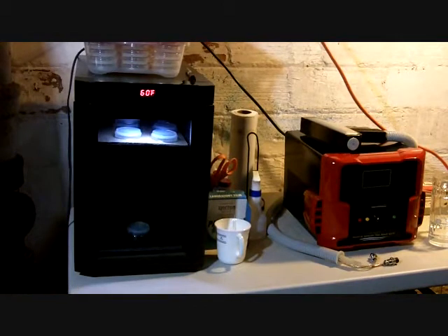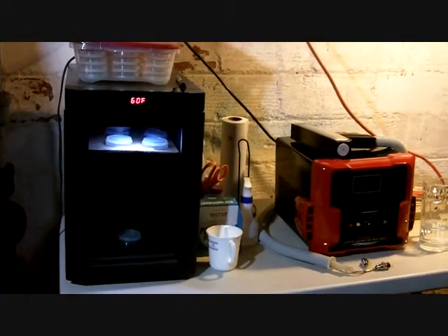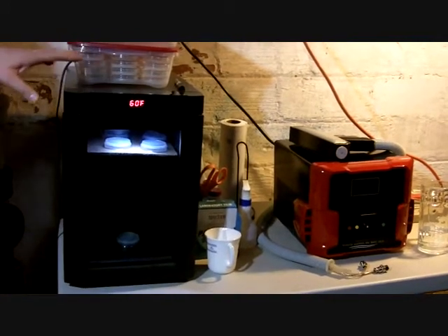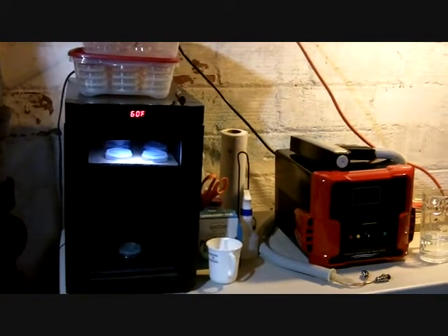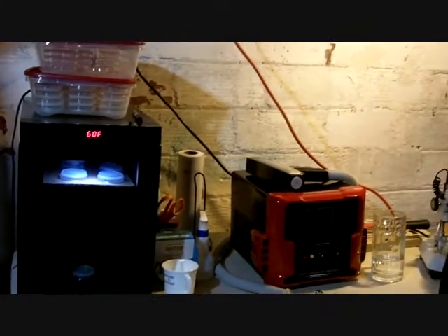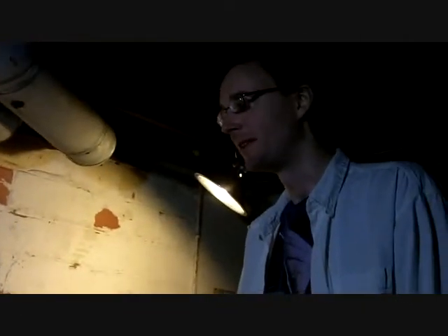And then you can do 16 degrees C, and that's kind of the standard for longer term storage of the worms and maintaining them in the background. And the typical lifespan is 3 weeks or so? At this temperature for the wild type, you'll get some of them that'll get close to 2 to 3 weeks. Most of them will die off at about 14, 15 days. But there's always a few stragglers.